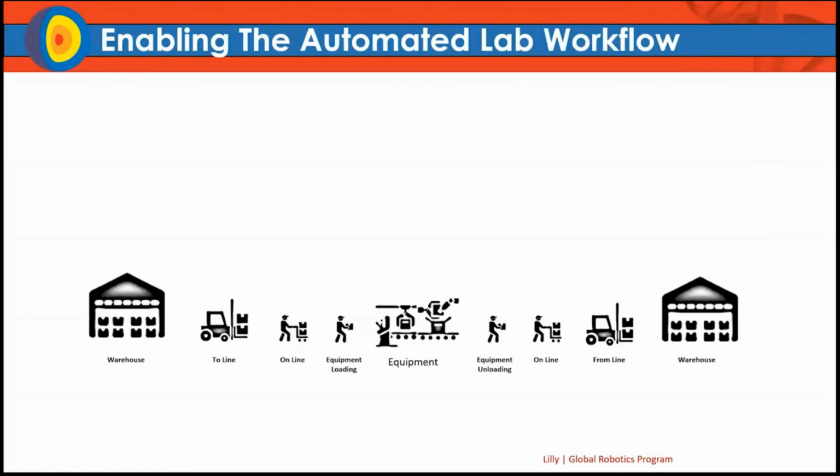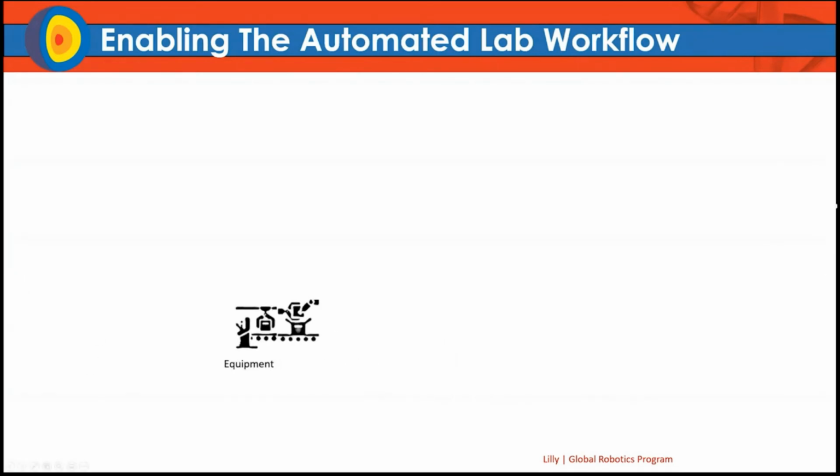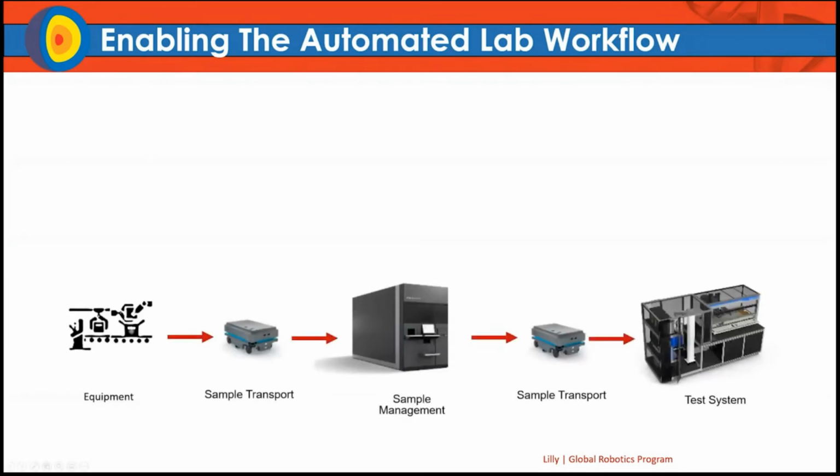In the Global Robotics program, we've adopted a dock-to-dock strategy. Essentially what that means is for each stage of the manufacturing process, we want to develop or identify robotic solutions that drive us closer to a fully automated state. And that also includes our quality control laboratories.